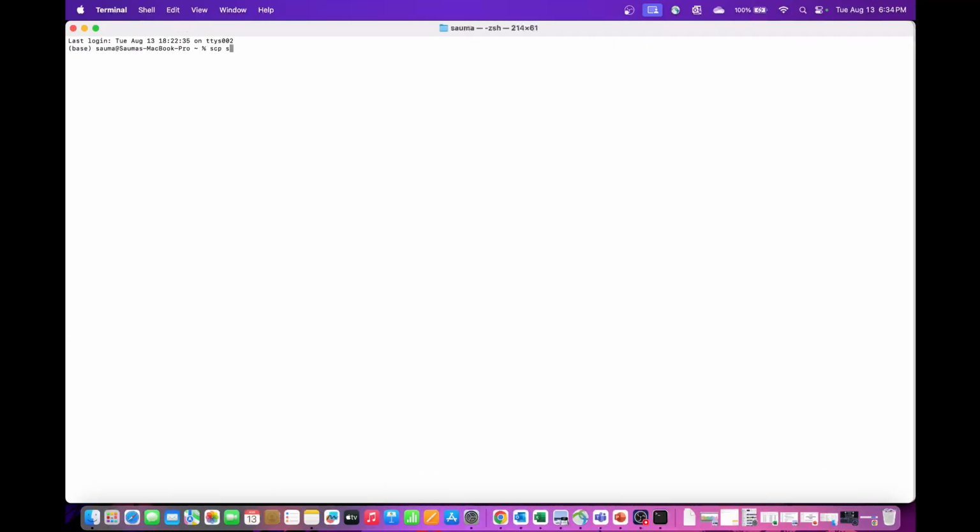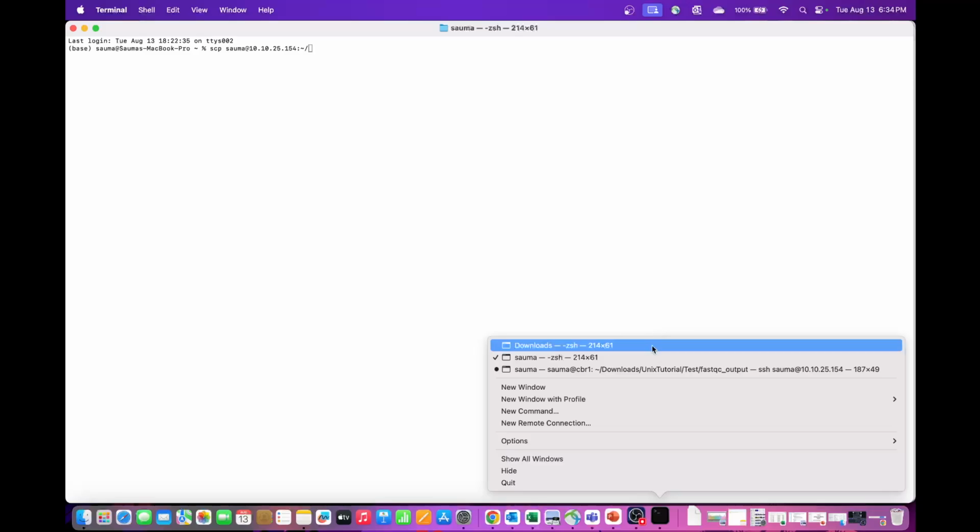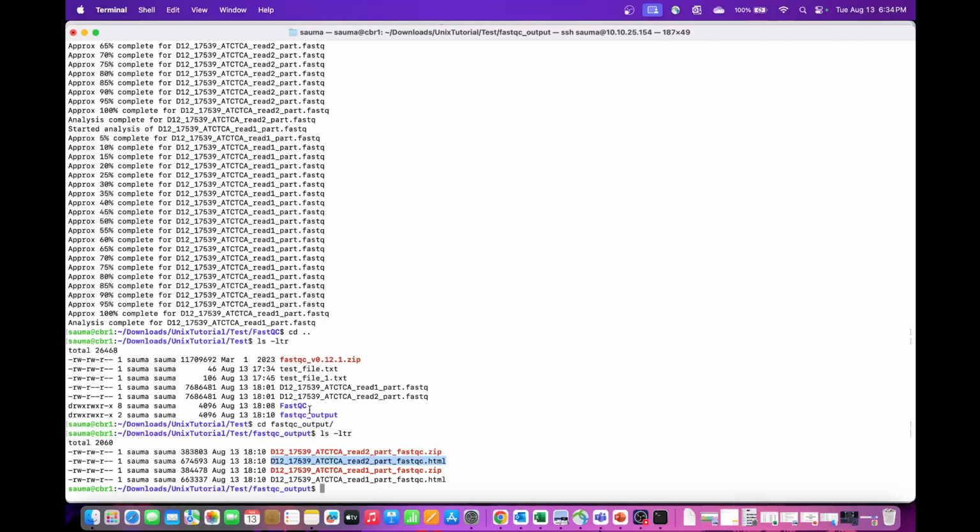SCP. It's the same SCP I used. Then this is my IP address. Now this is the place where it is. So I have to give the whole path. So if I move here, this is the path.